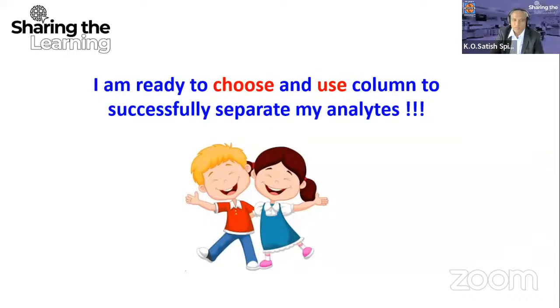So there's another question from Kabita Sharma. Does the ideal chromatogram of nucleic acids at physiological pH of the cell still remain the same even after DNA or RNA gets denatured due to changing pH in the HPLC columns? No, it will change. It will change because the pH plays a very important role in HPLC analysis.